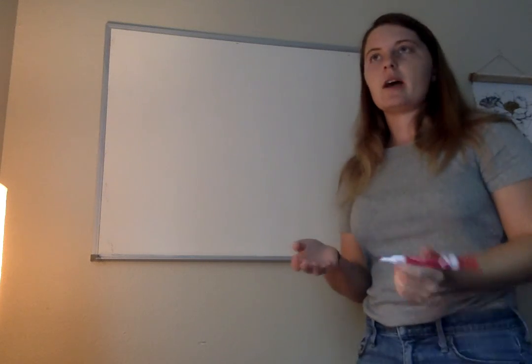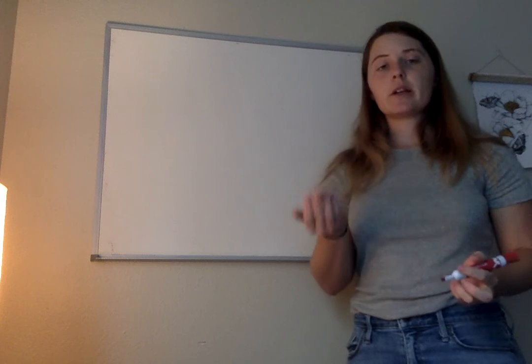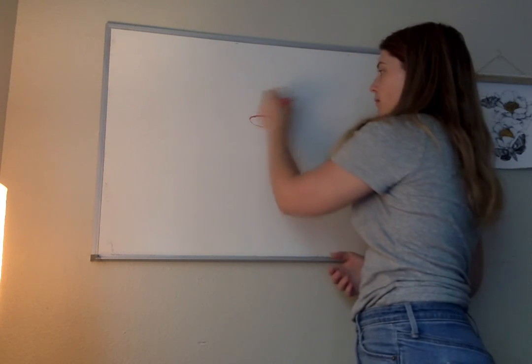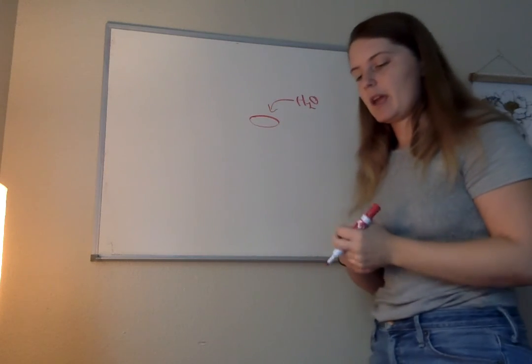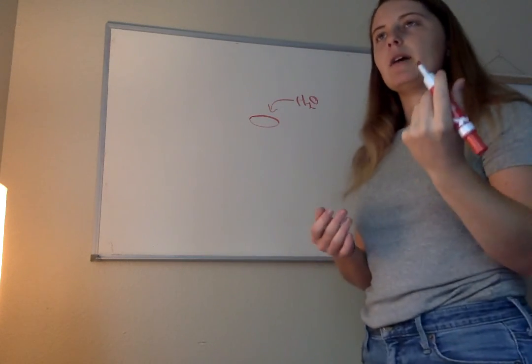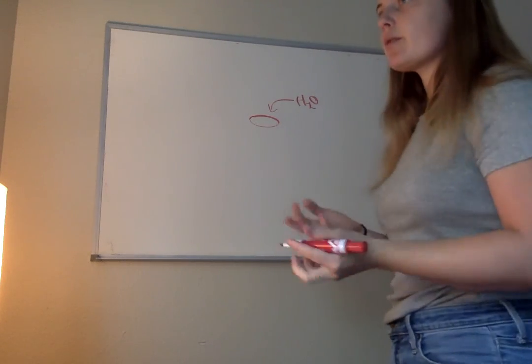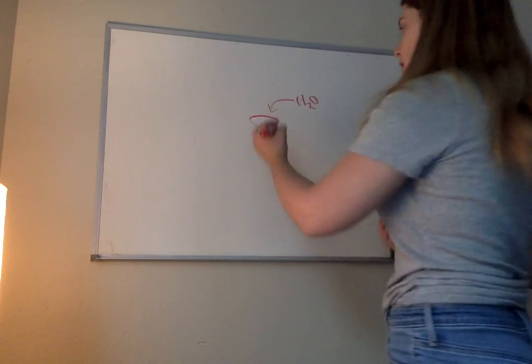Another good question is why we use molecular sieves. Molecular sieves absorb water. They're just like little pillows, and they soak up water. In the E1 reaction, water is our leaving group. So through using Le Chatelier's principle, it's going to pick up water from the reaction.